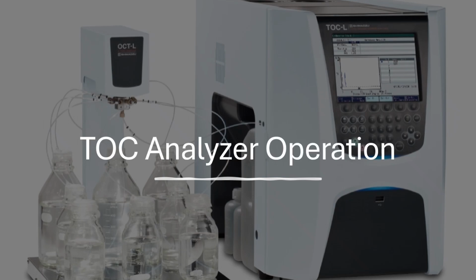So today in this video we are going to discuss the TOC analyzer, that is, how to operate and analyze the sample, how to initialize the instrument, how to connect with the software, how to shut down the system, and how to perform the analysis while using the TOC analyzer. So here I am explaining the TOC analyzer of make Shimadzu, right?